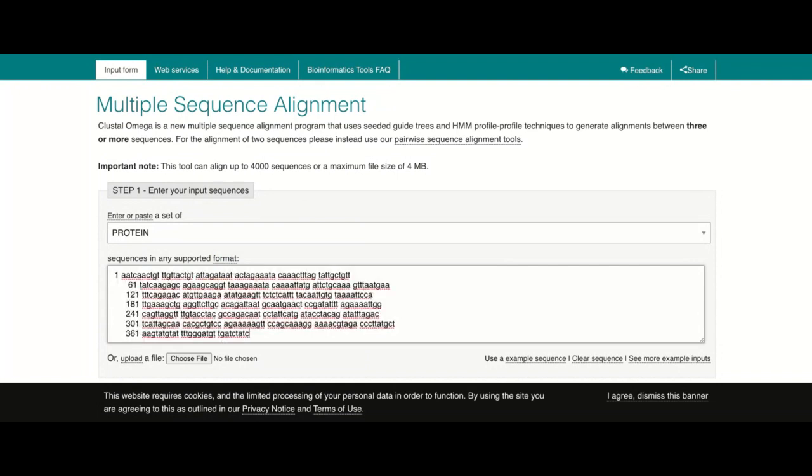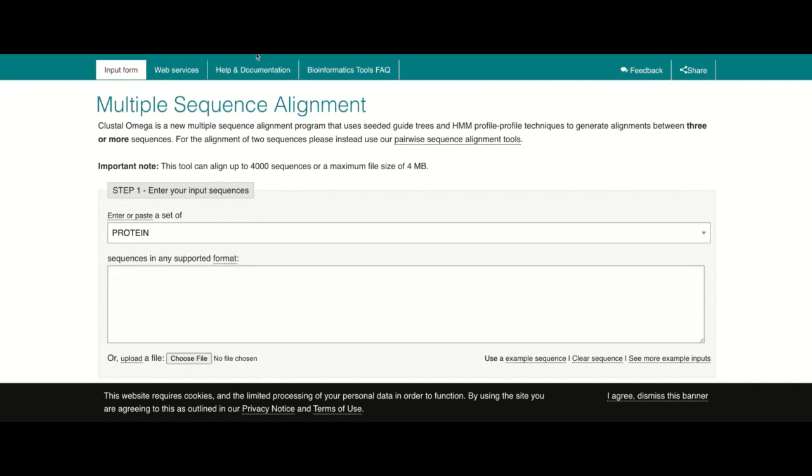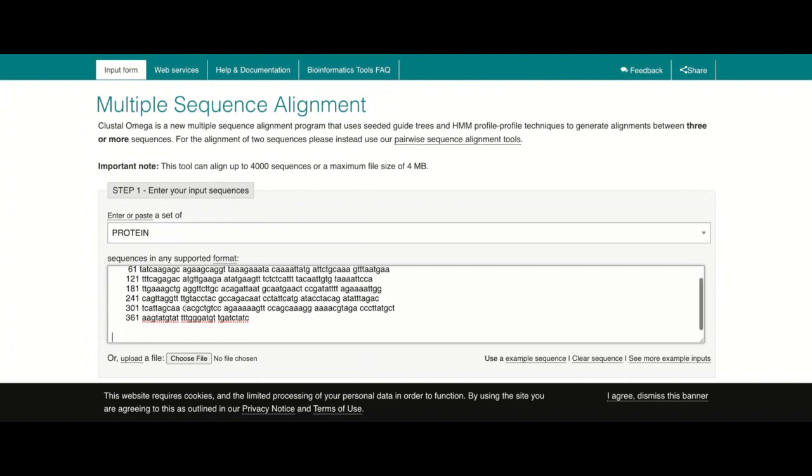So, okay, there is one problem here already, but I'm going to pretend like I don't know yet. So there will be two problems. First one is, okay, I entered my first sequence. Now I'm gonna go to the second tab, which you don't see what I'm doing, but I'm going to those NCBI tabs. And now I need to see which one. Now I don't know which one I already copied and pasted. Let me do again. So I need to do this systematically on which tabs I have open.